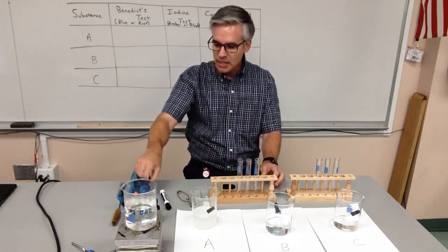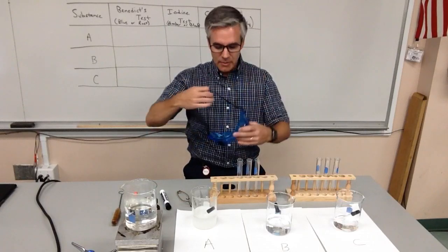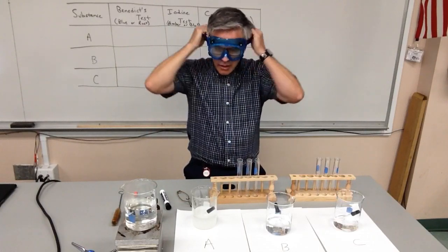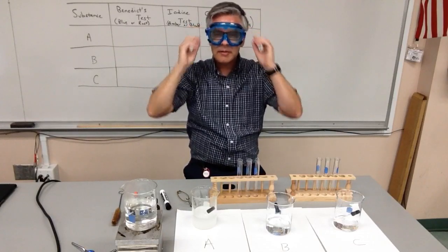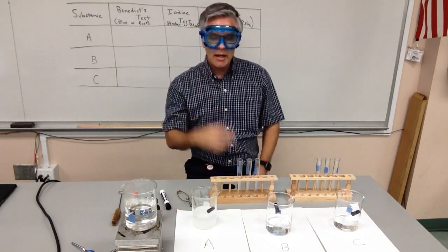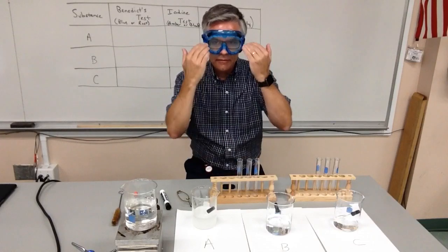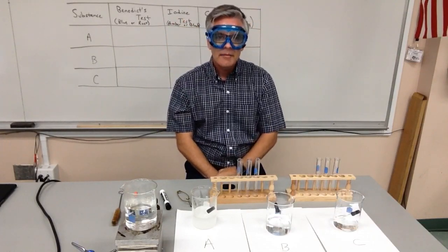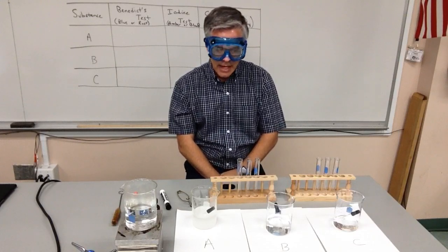The other thing is we are dealing with chemicals, so we are going to have our goggles on. I'm going to go ahead and put mine on right now. Remember, safety goggles are a little bit more protective as opposed to just normal eyeglasses. Eyeglasses are just shielding the very front of the face, but other stuff could still drip in. These are splash proof, so those are going to be my safety goggles for the day.